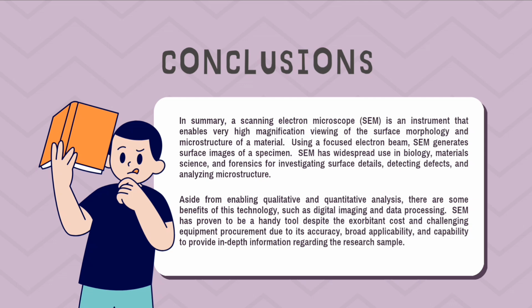Aside from enabling qualitative and quantitative analysis, there are some benefits of this technology, such as digital imaging and data processing. SEM has proven to be a handy tool despite the exorbitant costs and challenging equipment procurement, due to its accuracy, broad applicability, and capability to provide in-depth information regarding the research sample.